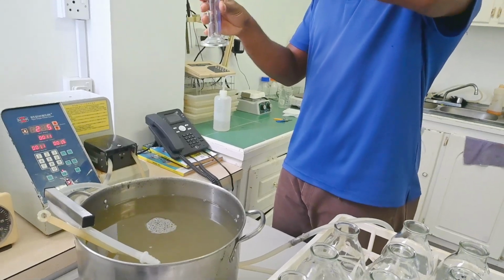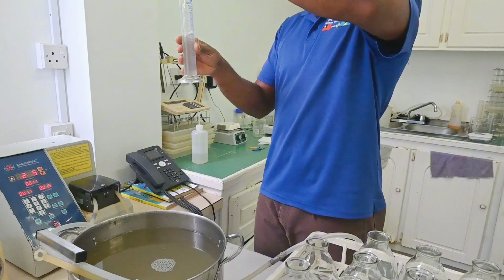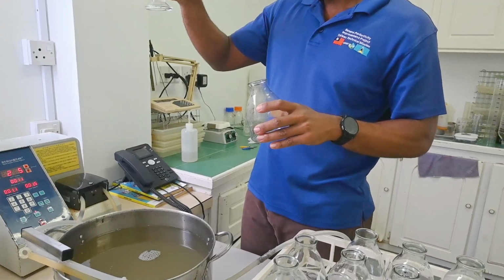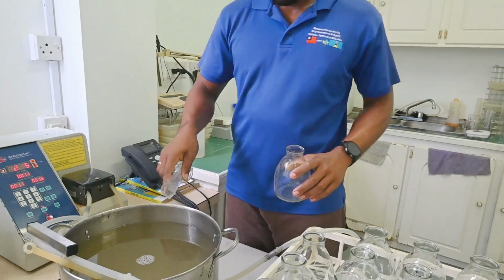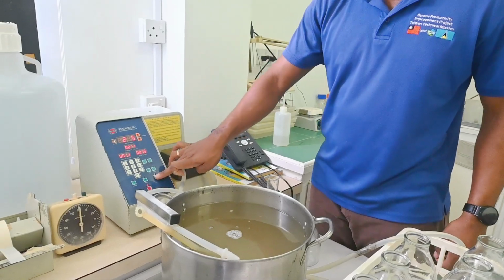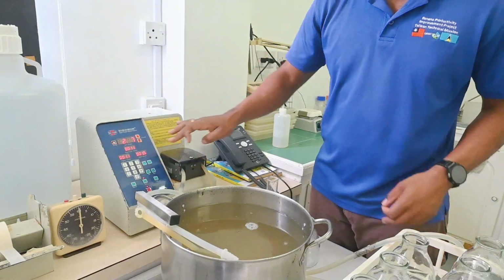So if we measure it, we should get 80 milliliters. It's a little less, so we have to adjust the flow rate. So how you do that is you just place it off, press calibrate, and you raise the dispense rate. You set it back to auto.